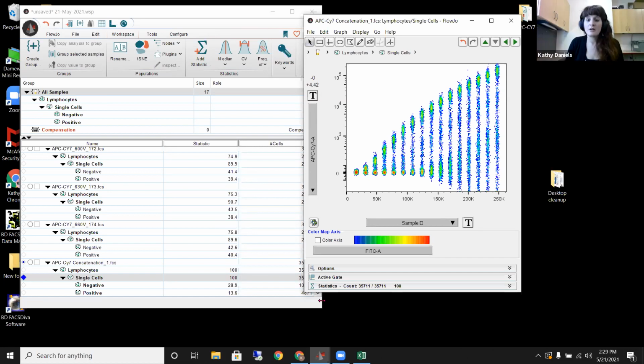Yeah, absolutely. And also understand that every instrument's different as well. Different instruments have different lasers, laser powers, optical configurations, and I really want to stress that just because you do it on one instrument, that does not mean you'd run it at the same settings for the PMTs or avalanche photodiodes, whatever your instrument is and whatever the detectors are, optimize it for the instrument. And cells are different as well, of course. Yes, yes.